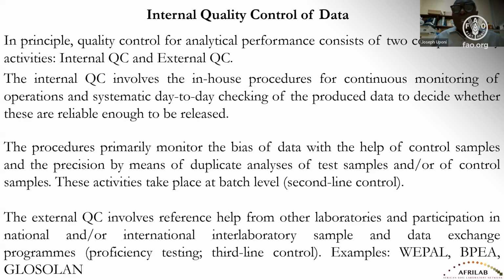There's also a relationship between your pH and exchangeable calcium in the soil. Even your organic carbon and total nitrogen have some relationship. When you find CN ratios that are outrageous, that are beyond 20 or below 8, then it's good to cross-check. Those are third line controls which experienced lab people can always find out after the final result has been compiled.